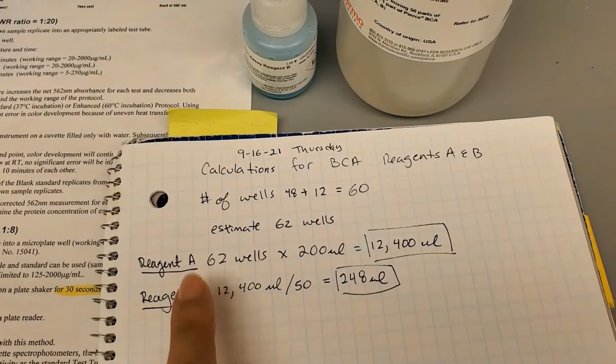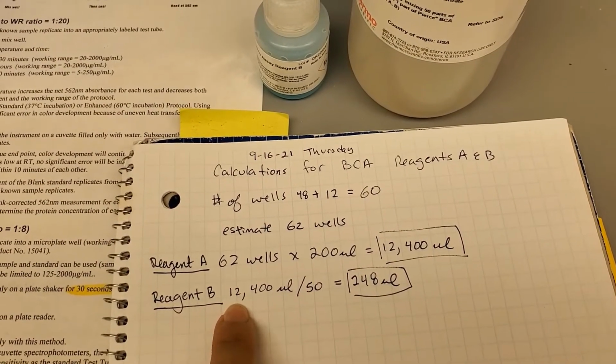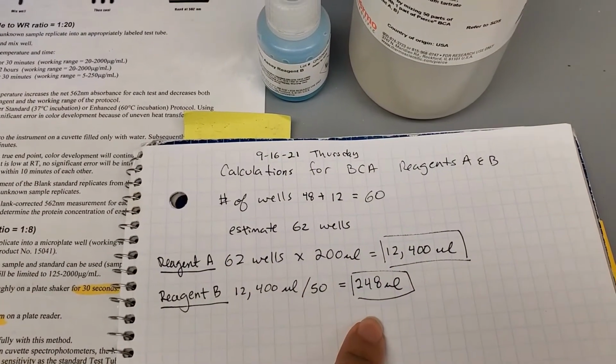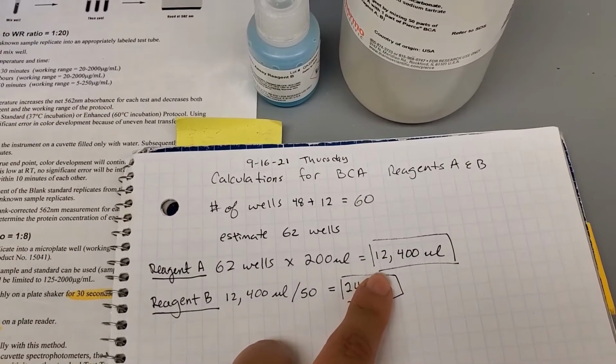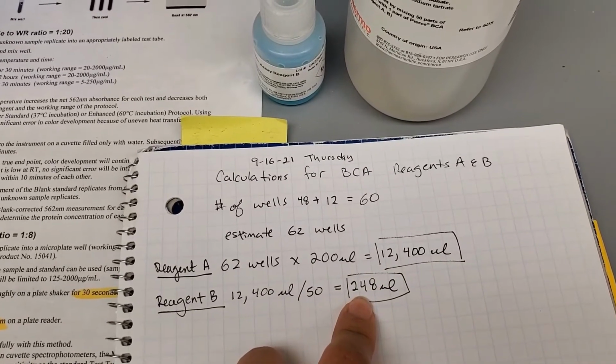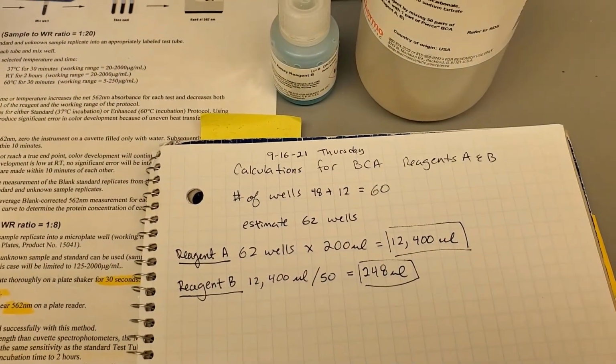And my reagent B, I use it at a dilution factor of 50. So I divide my total volume of my reagent A by 50. So I know that to the 12 milliliters and 400 microliters, I'm going to add 248 microliters of my reagent B. So I'll go ahead and mix those right now.